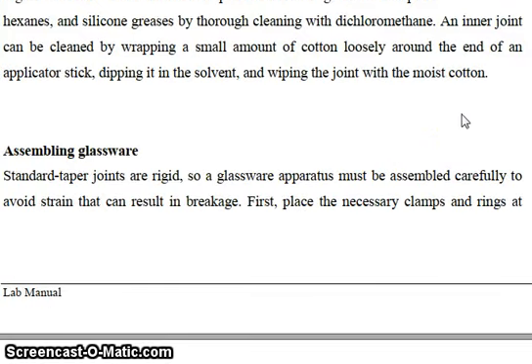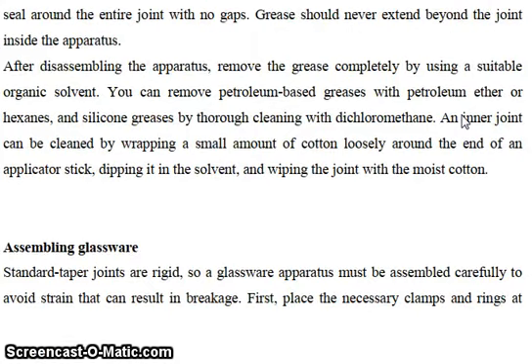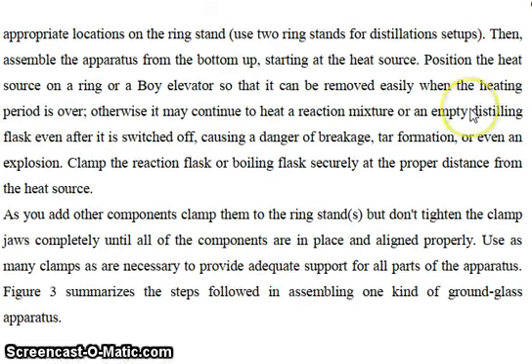Now, assembling glassware. Standard taper joints are rigid, so glassware apparatus must be assembled carefully to avoid strain that can result in breakage. First, place the necessary clamp and ring at appropriate locations on the ring stand. Use two ring stands for a distillation setup. Then assemble the apparatus from the bottom up, starting at the heat source.